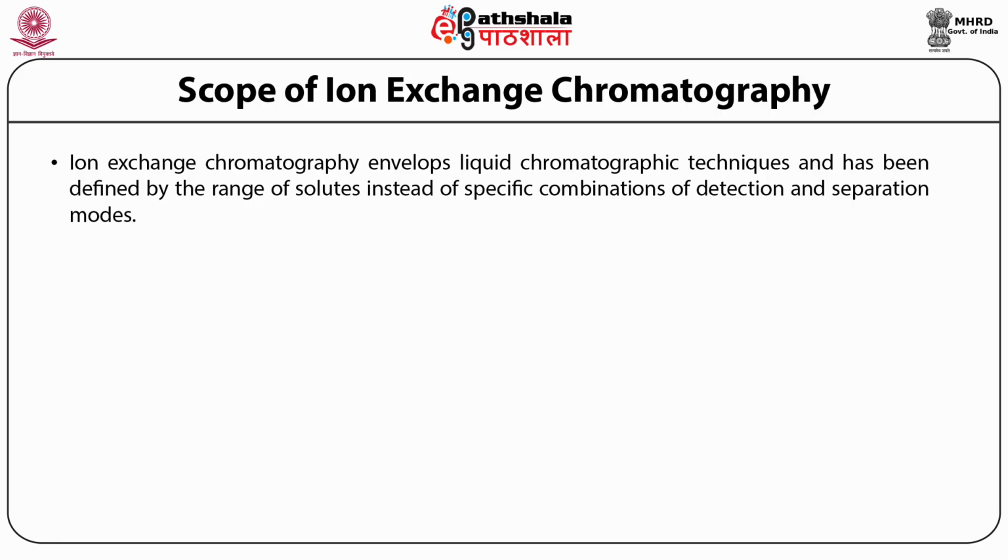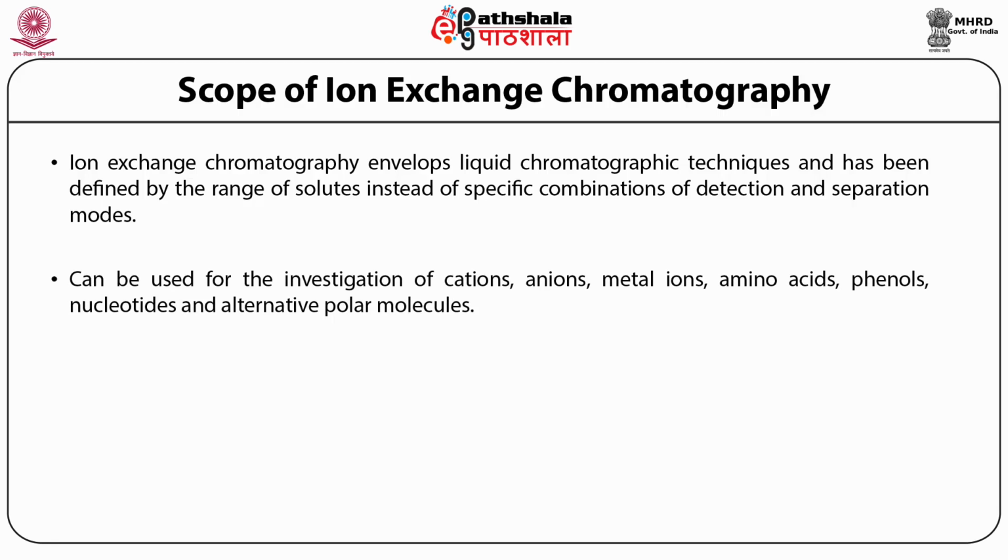The development of IEC is prompt as it provides a reliable and authentic method for the investigation of cations, anions, metal ions, amino acids, phenols, nucleotides, and other polar molecules.